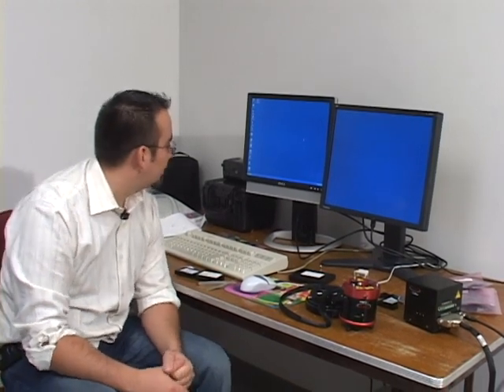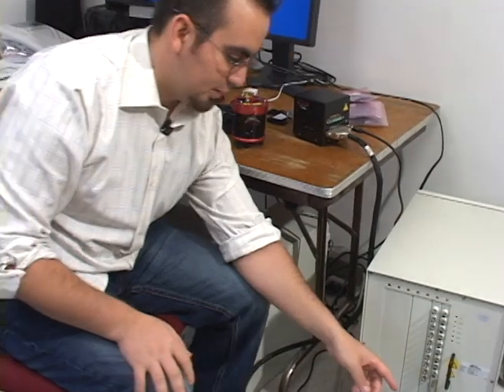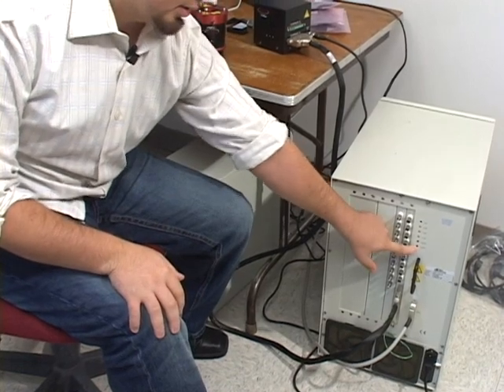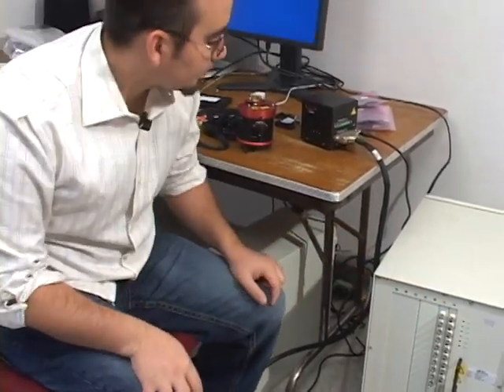Okay. So first thing we're gonna do is contact mode, and we'll go over the steps of how to do contact mode. Of course, have the computer on first, then turn on the controller with the switch that's right above the power plug, and we went over this. It's right here. After you turn it on, make sure all the LEDs are on the controller. And that will show you that all the power supplies are operational.